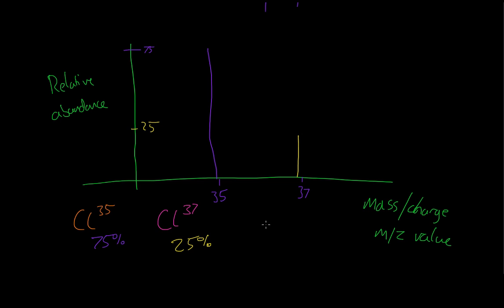This shows us that in our sample we had two isotopes, chlorine 35 and chlorine 37, and that the relative abundances were 75% and 25%. Now you can imagine this usefulness if we apply it to something like if we got a sample of oil in there, we'd have a bunch of different chemicals in the oil, and we'd be able to see the masses of all of these chemicals and how abundant they are, so we can see what the primary element is.